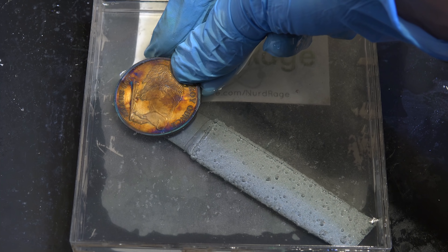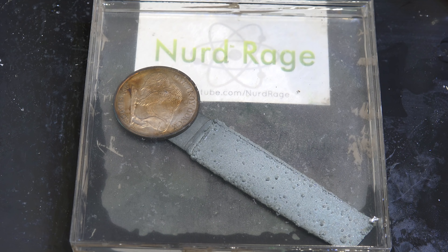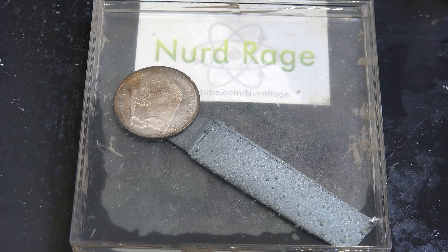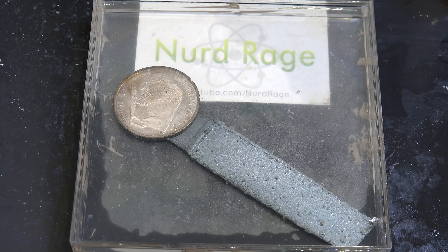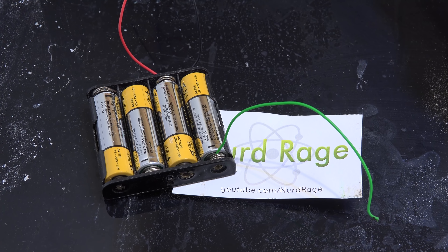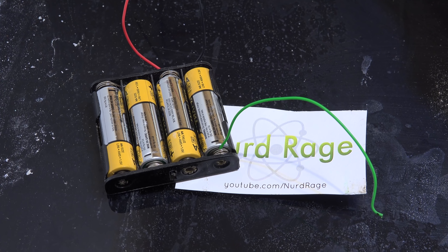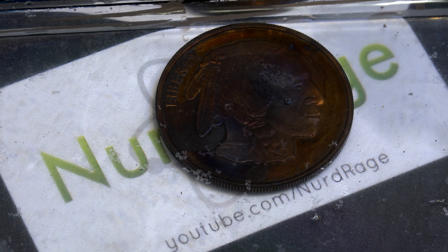Let me try it again, this time using a strip of nickel metal on which we've plated zinc metal. The upper end of the strip is still nickel metal. Now zinc has a lower reduction potential than silver sulfide, so this should work. But to make this experiment more interesting, I'm going to put the tarnished silver on the nickel end. Interestingly enough it's still working. This emphasizes the electrical nature of this experiment — the zinc is being oxidized by the solution as usual, but the electrons travel through the nickel strip and into the silver where the reaction takes place. The nickel itself doesn't do anything but act as the conductor for the electrons.